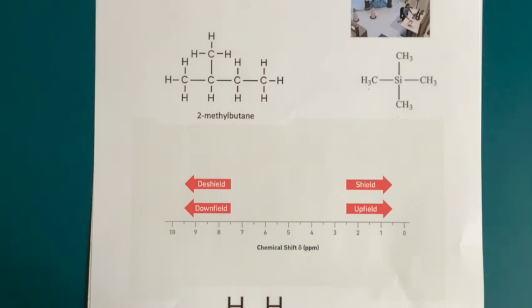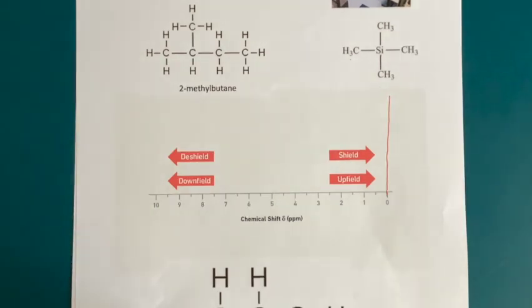all of those hydrogen nuclei will be influenced by the magnetic field in the identical manner. So they will give one uniform signal, and that is what would give us the starting point or the calibration point for NMR spectroscopy. A huge peak from those 12 hydrogens at chemical shift value equal to 0. That chemical shift value, you don't really need to know what chemical shift means or what unit it is. You see it's usually written in parts per million.